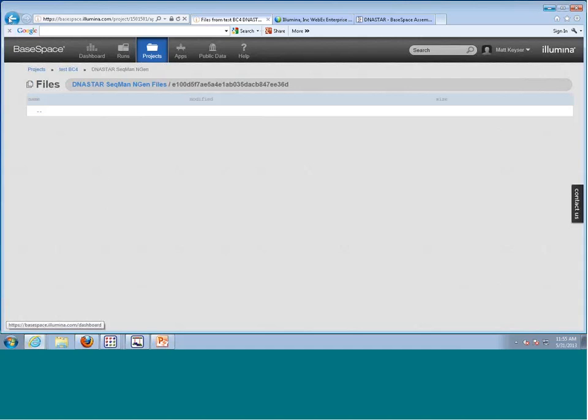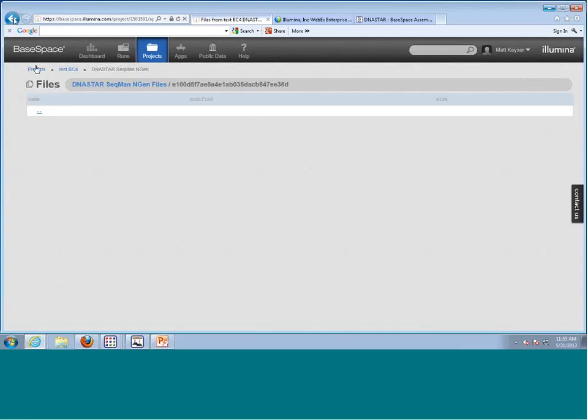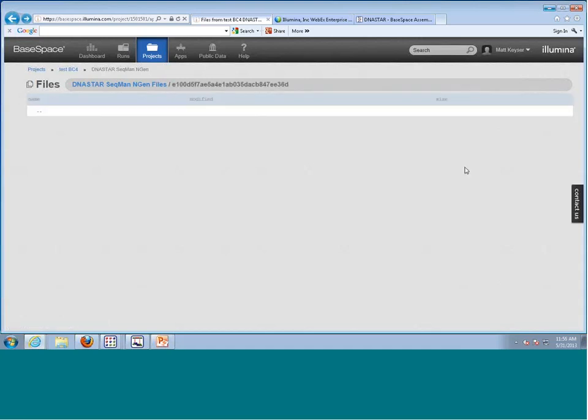So it looks like, let's see here. I'll try that one more time. And I'll try a different project. It's not coming up for me here.